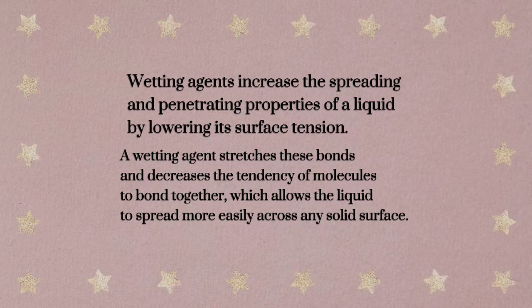Wetting agents increase the spreading and penetrating properties of a liquid by lowering its surface tension. A wetting agent decreases the tendency of molecules to bond together, which allows the liquid to spread more easily across any solid surface.